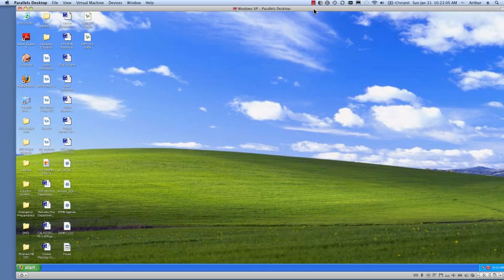Hi, this short video will take you through the steps to start up HAL or HAL 1-year-old using the tablet computer. When you first start up the computer, it will go through its normal process on the PC side and bring you up to a blank screen. This is my personal one, which has more information here on the side, but the regular screen that you'll see will only have a couple of icons on it.